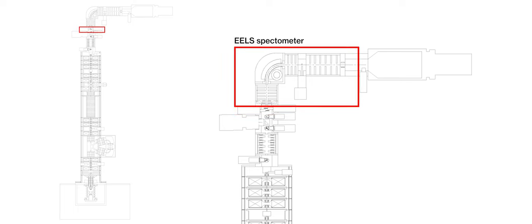In the EELS spectrometer, it has 5 layers of optical elements to correct the aberrations of the beam entering the EELS bending magnet. And then after the energy dispersion, you will have some other modules to correct the chromatic aberrations of the beam. And then you have magnifying optical elements to define the energy dispersion. So you have 1 millielectron volt per channel, or 1 eV per channel. They are defined by a combination of optical settings. And then we have the Dectris Ella camera here.